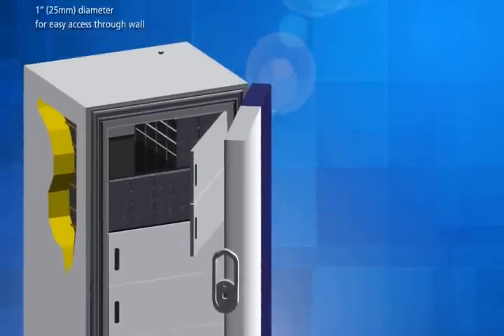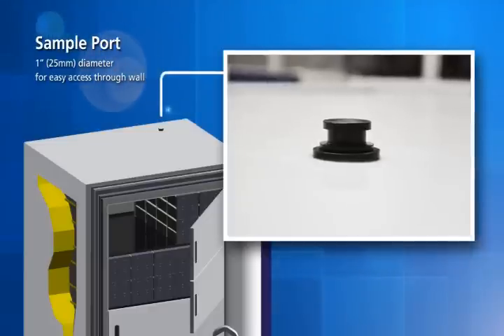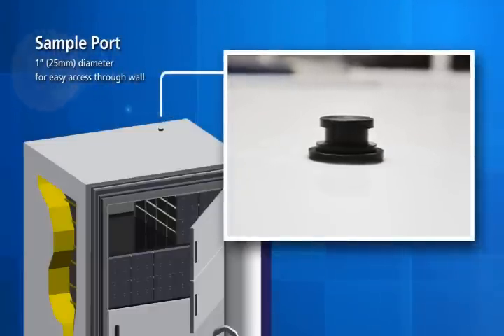The access port located on top of the freezer provides easy installation of the carbon dioxide and liquid nitrogen gas backup system.